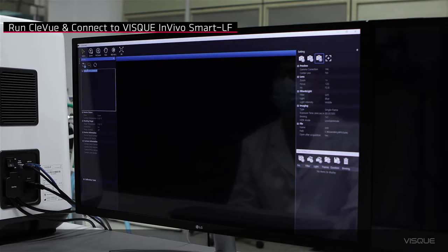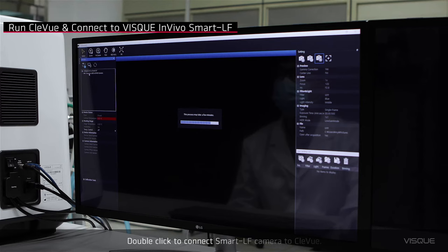Click the connection icon from the device window. Double-click to connect Smart LF camera to Cleview. Check the connection button from the device.